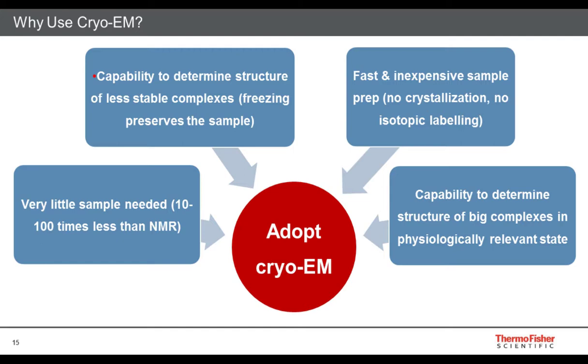Why is Cryo-EM so important from, let's say, an experimental point of view? Why is it interesting compared to the alternative technologies, which definitely also still have a lot of value and are still used a lot? One important example is when you do Cryo-EM, the word already says it, you're vitrifying, you're cryo-fixing the samples. And cryofixation is extremely important because it gives you the best possible structural preservation. If you do this in another way, by using chemical fixatives, there is a high chance of creating all kinds of artifacts. And you want to really look at reality in the most accurate state possible. And this is where vitrification plays a role.